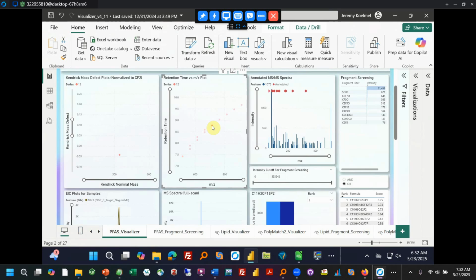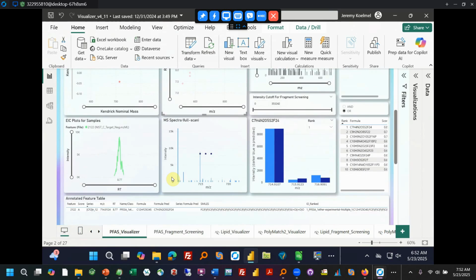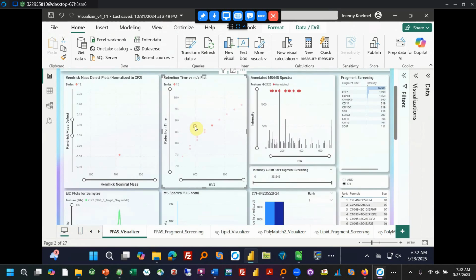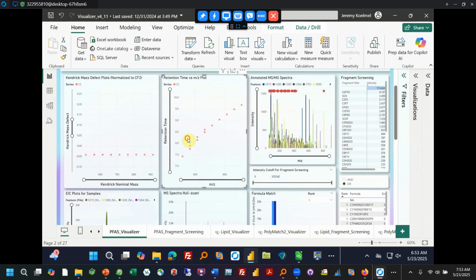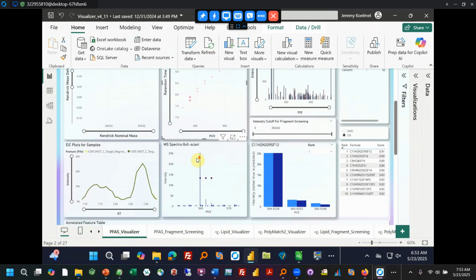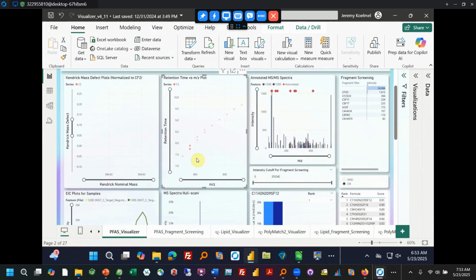Same thing, if we look over here, we're probably going to see a couple of different ether linkages. And you can see that this peak is a little bit wide, potentially. Again, I'll also look at the isomers. Yes, indeed, here's 2 very widely separated isomers. If we look at the fragmentation in the case of the sulfonic acids, we couldn't see any difference in the fragmentation for the isomers, so I didn't look at it.